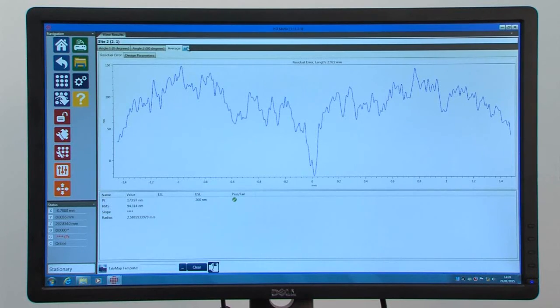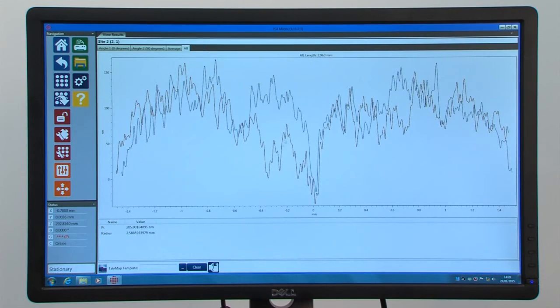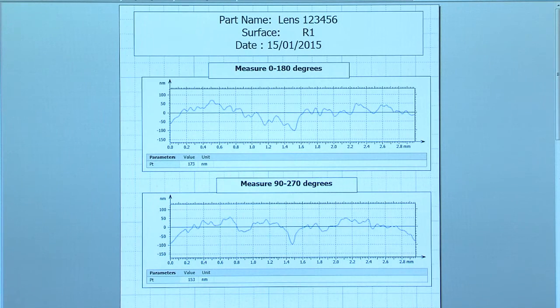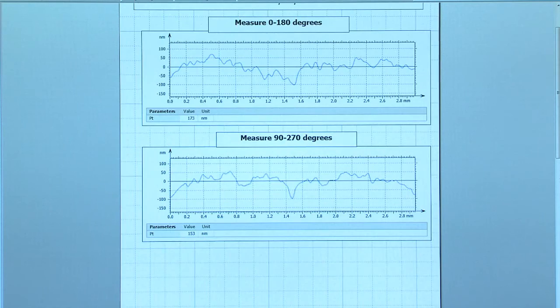Surface traces can be easily sent to Tallymap to see the results in detail and view the 3D astigmatic plot for individual parts.